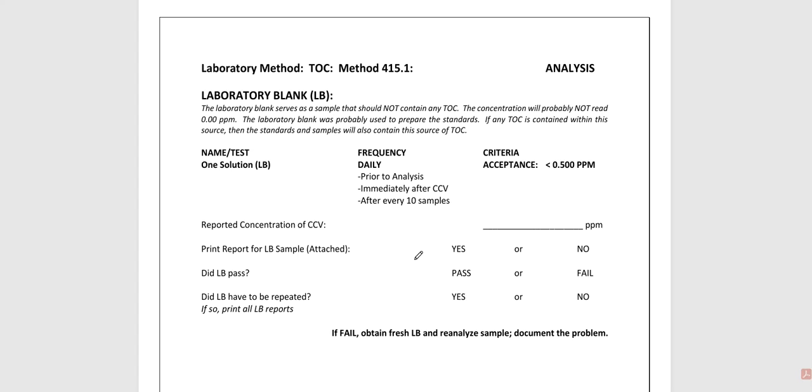We need to report it. We need to see what's there. So it looks like we got to do this every day, of course. Immediately after the continuing calibration verification, after every 10 samples, we should be running a blank. And these are the minimum requirements.